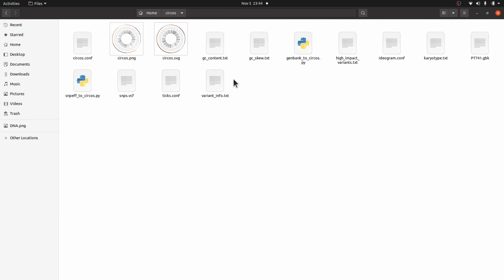So that is it for this episode of Circos. So if you have a microbial genome, okay, a single chromosome, then you can try to use these materials to generate the plots. Okay, so this is how I bring this to an end. Okay, so you can check this playlist here to find more tutorials on Circos.